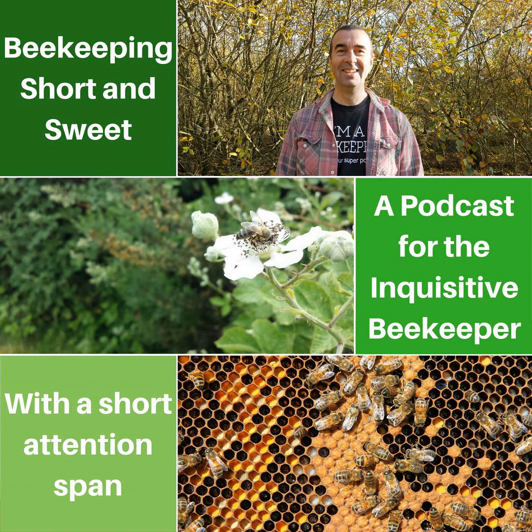Incredible. And the company's really renowned for selling microscopes to universities, colleges, schools, scientific-based laboratories, and not really so much for beekeepers. Yeah, beekeepers are one of quite a number of groups that need microscopes because they keep a living organism in a relatively artificial environment. Koi carp keepers are the same, racing pigeon keepers are the same, and so on. And if you do that, inevitably it interferes with the natural balance between parasites, diseases, and normal healthy specimens. Sure. So there is always an issue going on between whether or not your hive is going to get problems and diseases, and to sort that out you need microscopes.